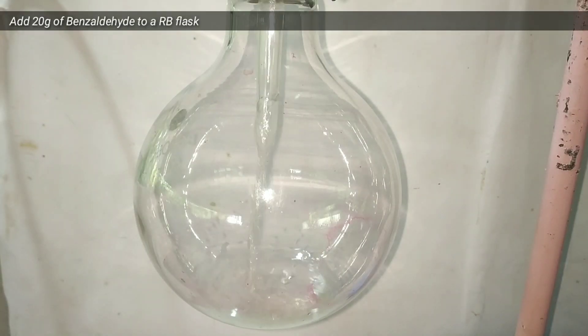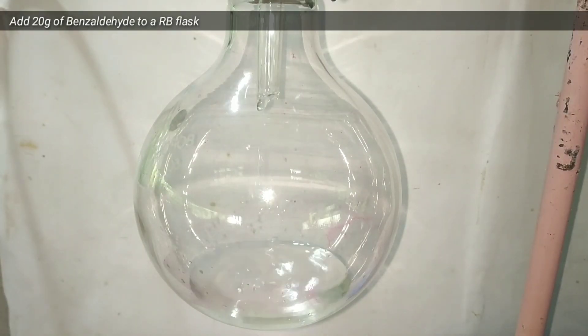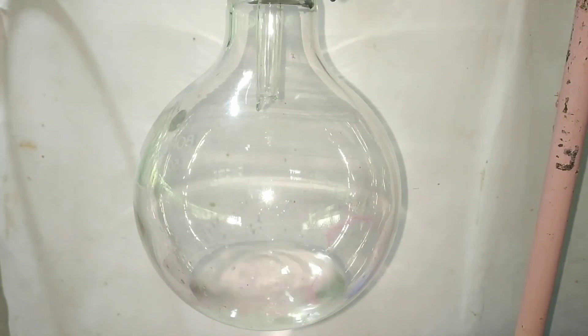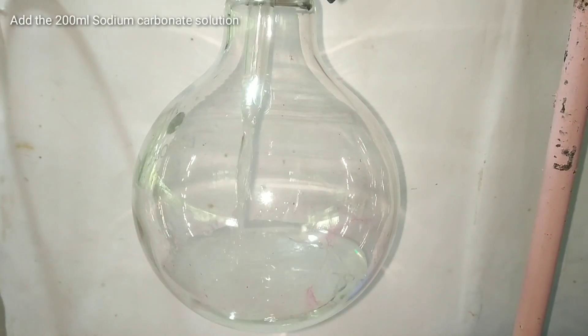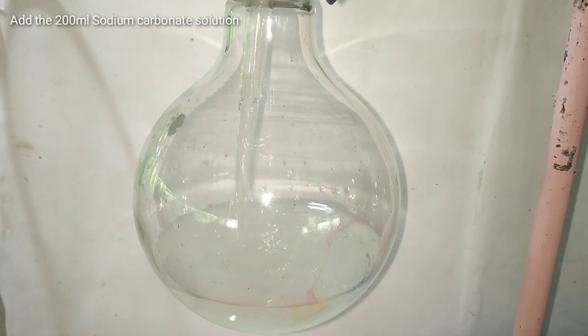We now take a 500 milliliter round bottom flask and add 20 grams of pre-weighed benzaldehyde into it. Now we add the sodium carbonate solution into the benzaldehyde.